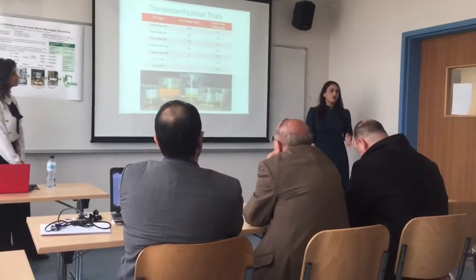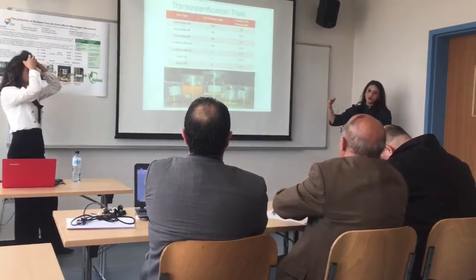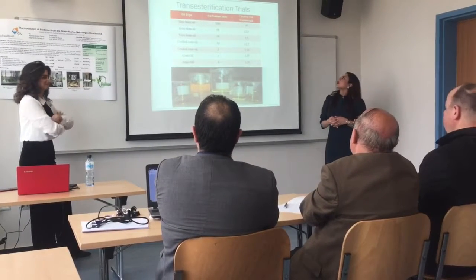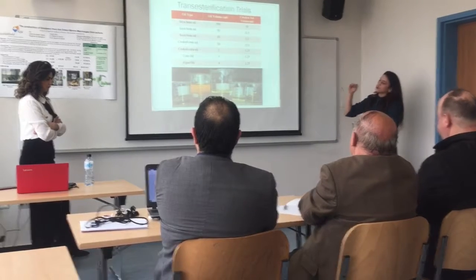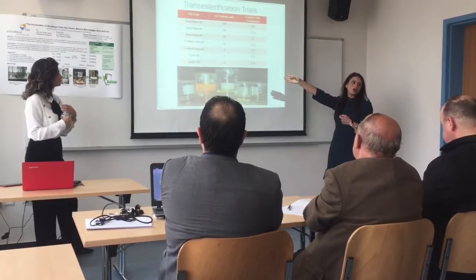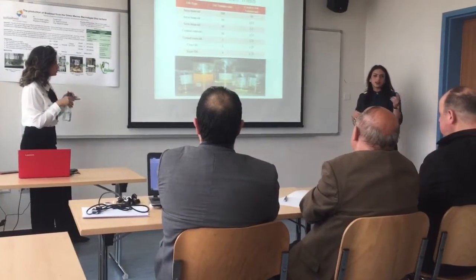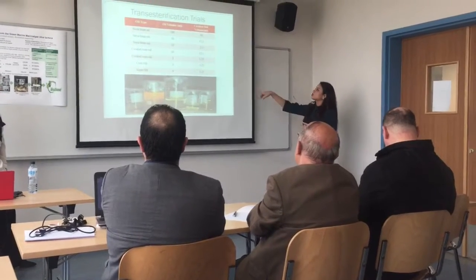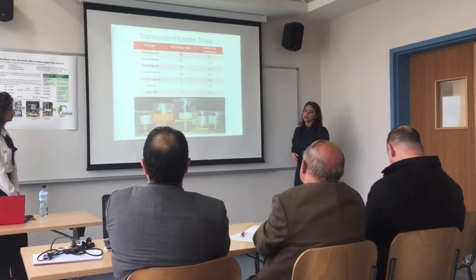As I mentioned, we used different oil types, but not only that, we used different oil volumes. Depending on the oil volume used, we would choose the catalyst solution volume calculated through an equation. The reason we used different oil volumes is that we wanted to minimize the reaction, since our algae oil was only around 4 milliliters. The catalyst solution volume, which is the methanol with the catalyst, had to be kept in mind. We had to keep in mind the 6:1 molar ratio which we spoke about before, which is higher than the actual alcohol requirement for a complete reaction.